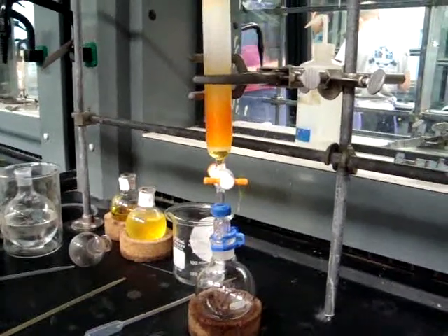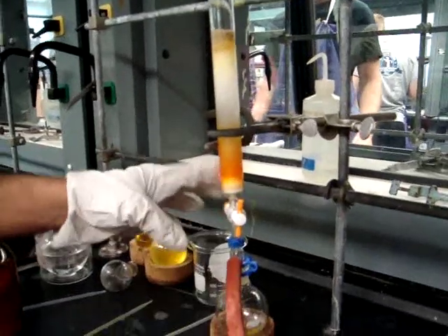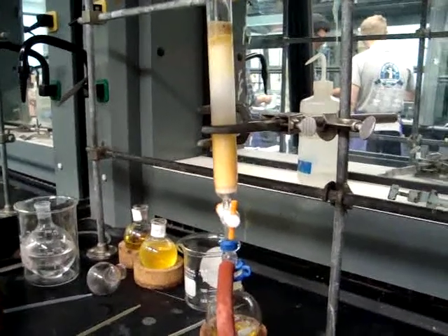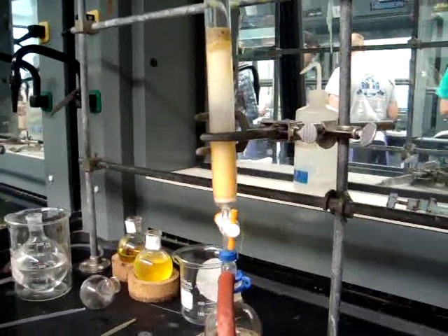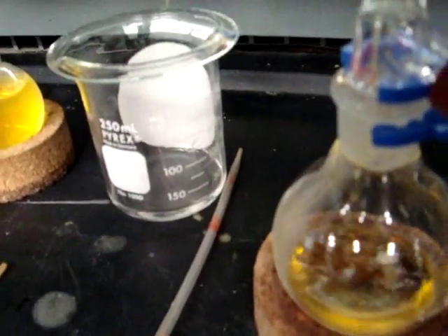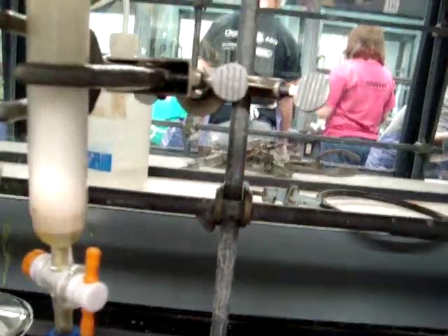Take a clean flask and attach it to the bottom of the column. You will now be removing the red layer. First, add your mixture of 50% pet ether and 50% dichloromethane to the top of the column. Then attach the vacuum, open the stopcock, and remove the entire red band. Once the red band has been removed, close the stopcock and remove the vacuum.